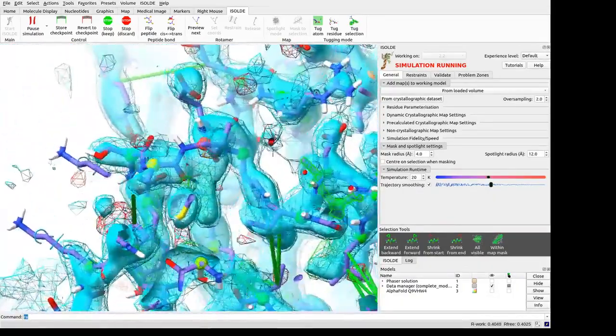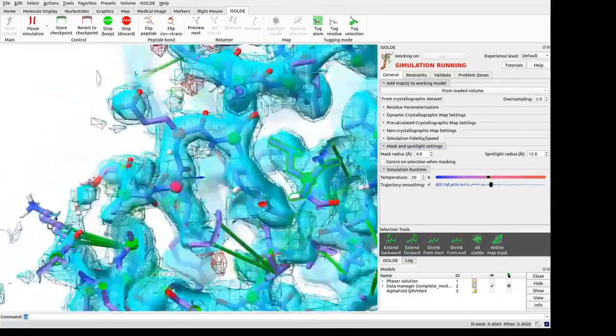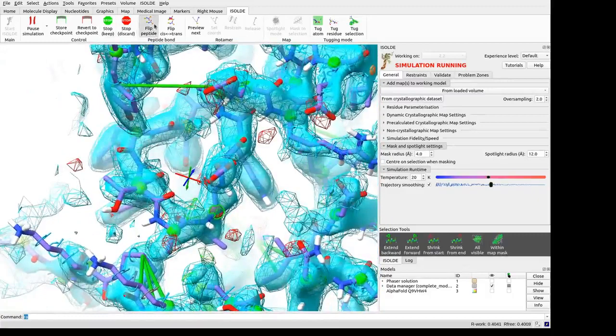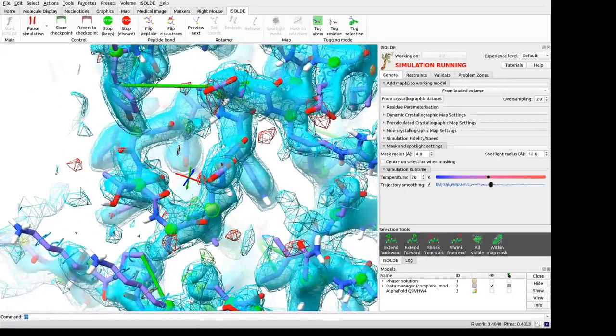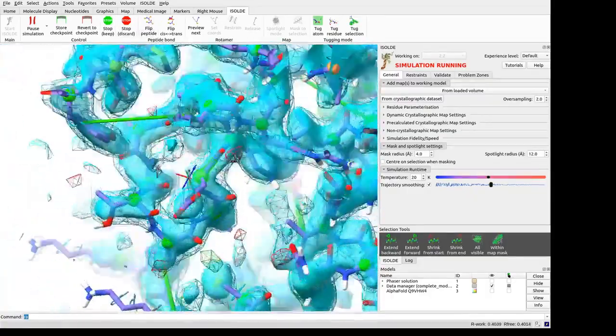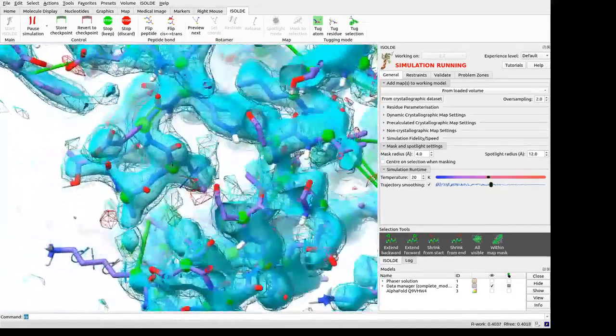In this case, completion of the modeling took a further 3 to 4 hours, first continuing this session to correct various gross disagreements, including symmetry clashes and one very mobile loop, followed by a round of refinement in Phenix.refine, and then a complete end-to-end pass through the model without AlphaFold restraints, checking and where necessary correcting the details of each residue.